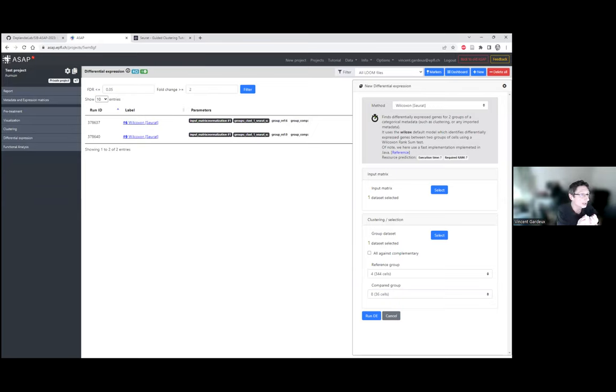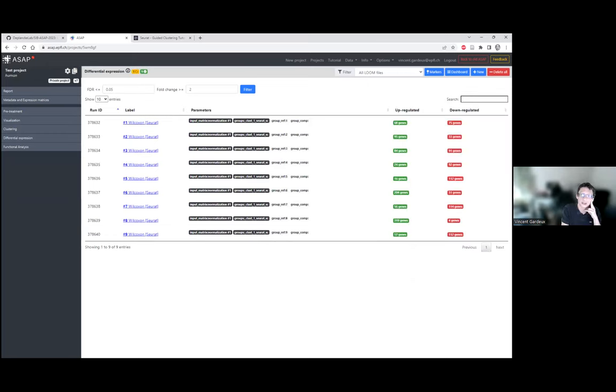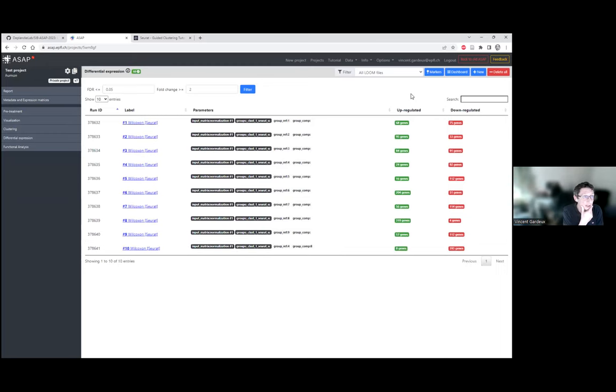So it's not a marker gene anymore. So it's really differential expression that you're doing. And you really try to find what is different between those two clusters in case you have some weird things, or you want to get more in depth into some of your interesting clusters, or if you have some conditions, because you may upload also data with different conditions or different culture or disease state or tumor state and stuff like that. And then maybe you want to compare tumor versus non-tumor, so you want to do really two groups and compare these two groups, that's also possible.